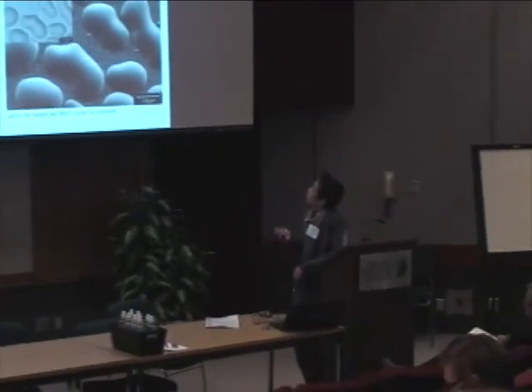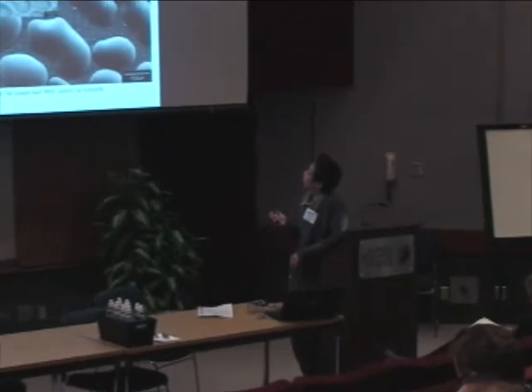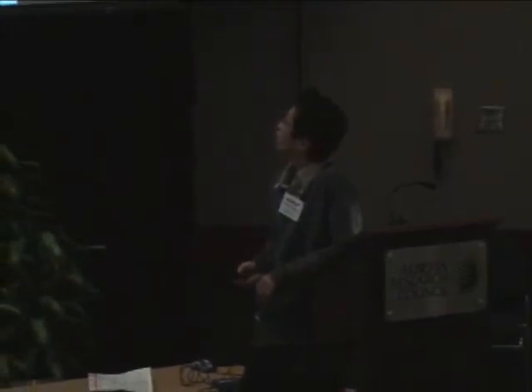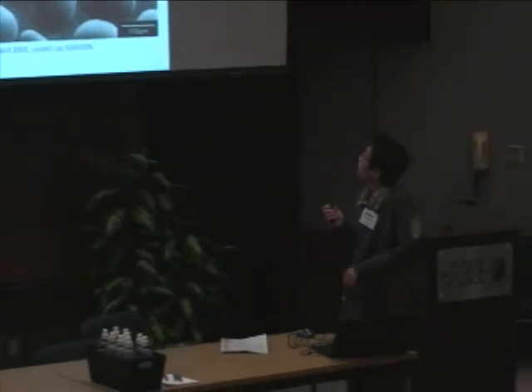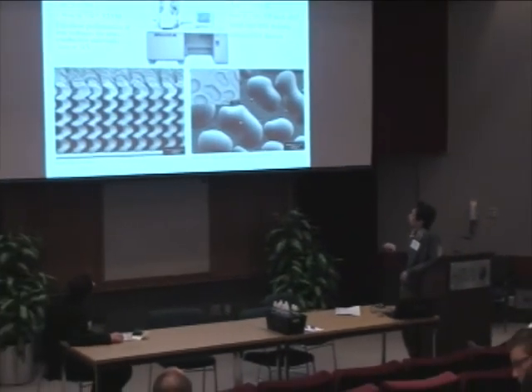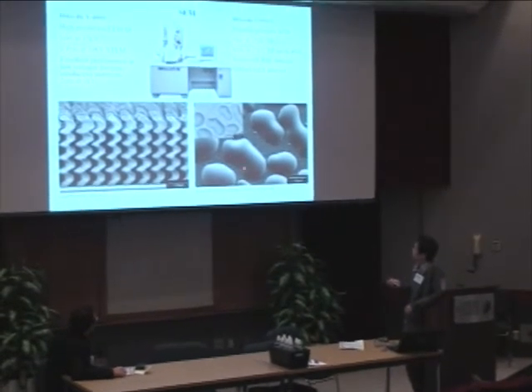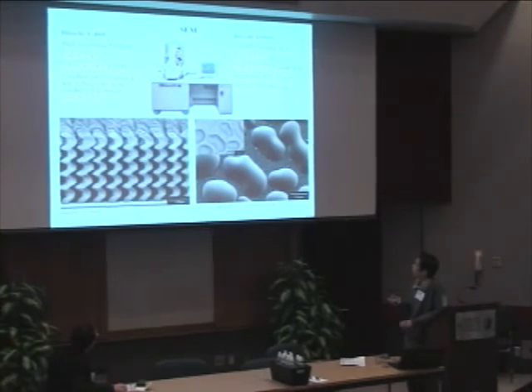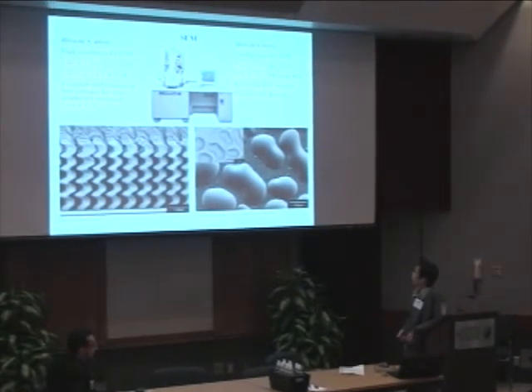The other, the 3000 SEM, is an environmental SEM that can take wet samples and is equipped with an EDX detector, so you can do some chemical analysis. Here is a typical secondary electron image and also a backscattered image showing the different materials of an alloy sample.